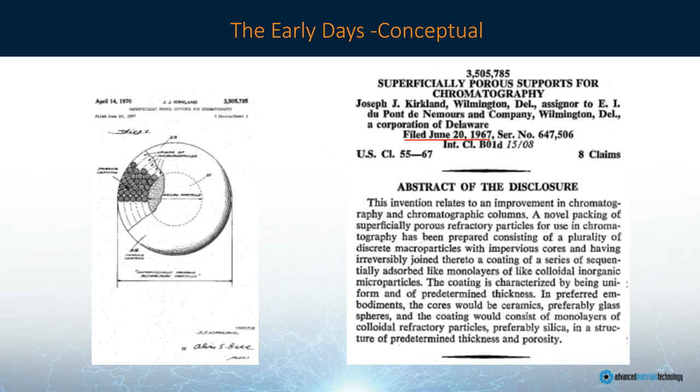So the superficially porous particle technology has been known for quite a while now. You can see the patent here is established in 1967 by Jack Kirkland, who up until recently was working at Advanced Materials. This invention is the basis for which these particle technologies that we're going to talk about come from. The patent describes a novel packing of these superficially porous particles, and it's essentially what we're going to be discussing today.